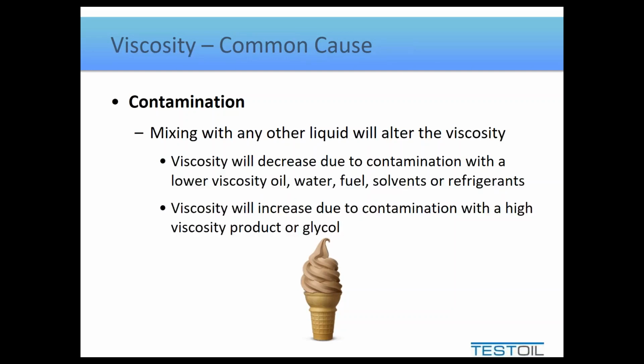That has everything to do with how readily oils will emulsify. Typically, the thickening effect is due to an emulsification, meaning that we're mixing two things that don't normally want to mix together. And in creating these emulsions, one of the things that happens is you trap a lot of small air bubbles. By trapping a bunch of small air bubbles, you will cause the viscosity to increase.